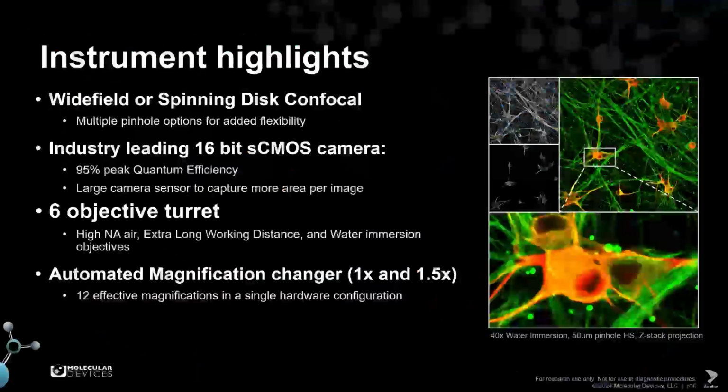So let's take a look at some of the instrument highlights. So as mentioned, this is a wide field or spinning disc confocal, or you can have both. In the confocal systems, we'll have both wide field as well as confocal capability.